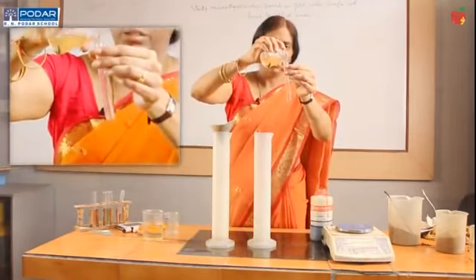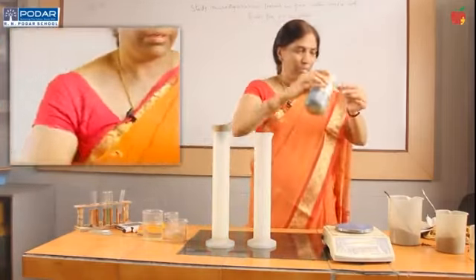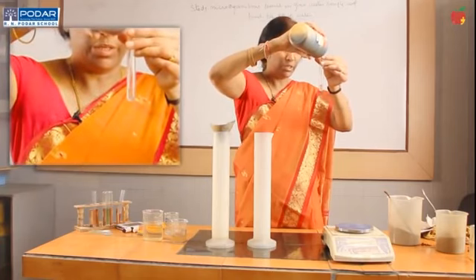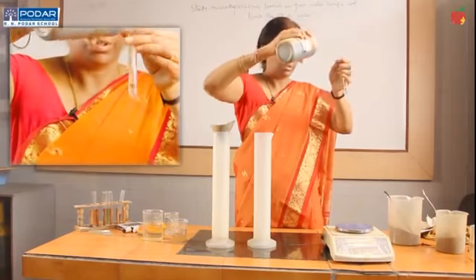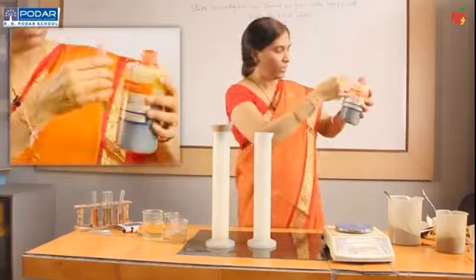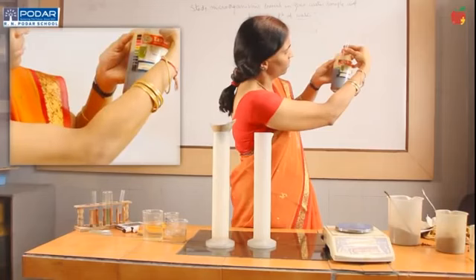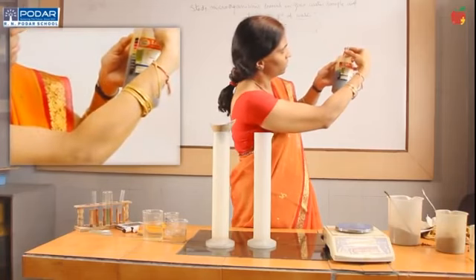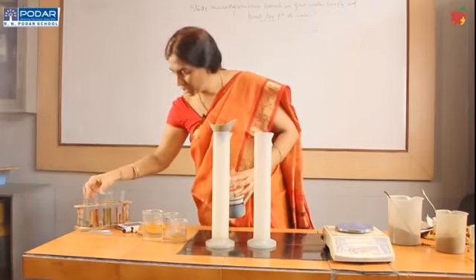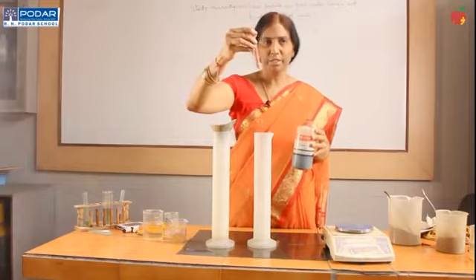I am taking the roadside soil solution, then testing the pH with the help of the indicator. I am adding 1 drop of pH indicator to the test tube, shake it, and find out the pH. This is coming around 7, slightly neutral. Again, the acidic nature of the garden soil sample is because of the organic matter present in it.